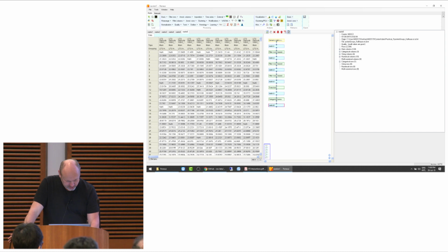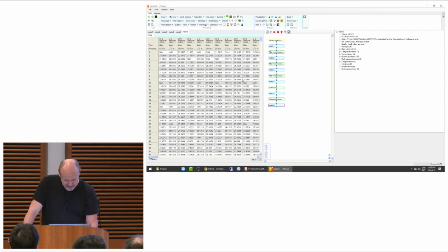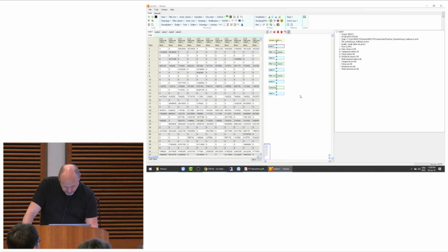Yeah, so now it did the grouping, but I also realize it's probably better to first rename the columns and then define the grouping, as it is also written in the PDF that I was showing you, right? Maybe I should read it before I do this here. But then you just see all the things that can go wrong, which has its educational purposes, I guess. So let's delete that again.